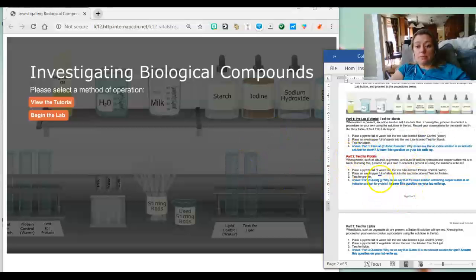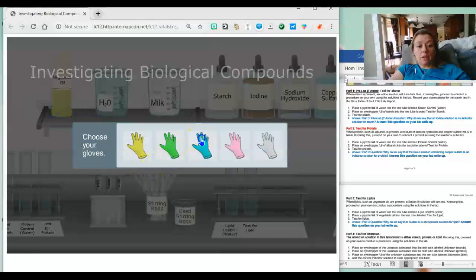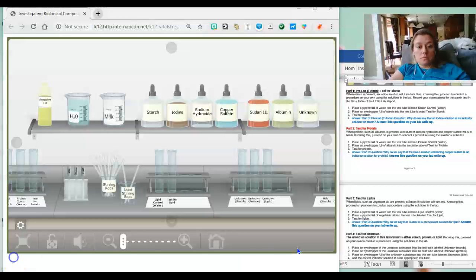Okay, let's get started. We're going to begin the lab. Choose your gloves.